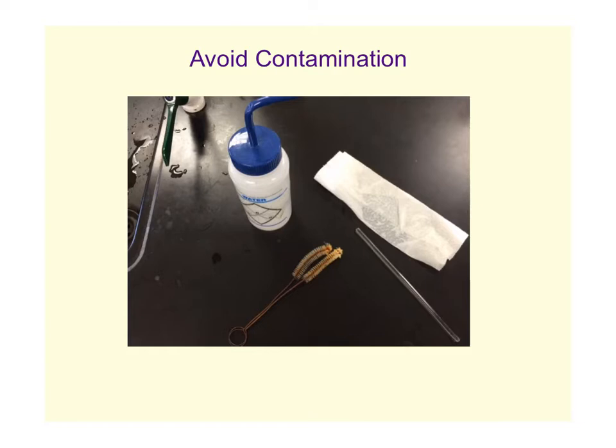Now, this is where I'm going to start with that lab under that general technique. So you can see keeping good records, I've already talked about it. I'm going to talk about again how you're going to have to write this lab up. But right now we're going to avoid contamination. So the idea is you're separating these ions. You don't want to mix your separated things up.